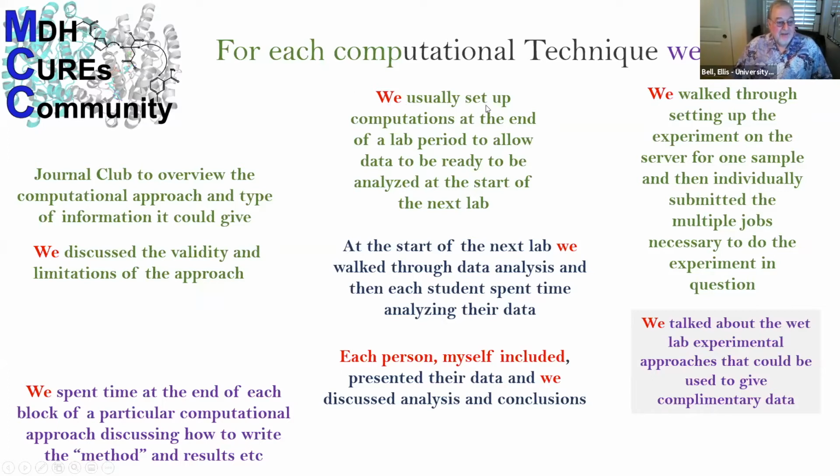We usually set up computations at the end of a lab period. The reason for that is many of the computations you submit to a server and you get the results back in 24 hours, so it didn't lend itself to in-class computations. There are some of the techniques where we could do things in real time, and I'll point that out as I summarize the techniques. But then at the start of the next lab, we walked through the data analysis, and then each student spent time analyzing their data.